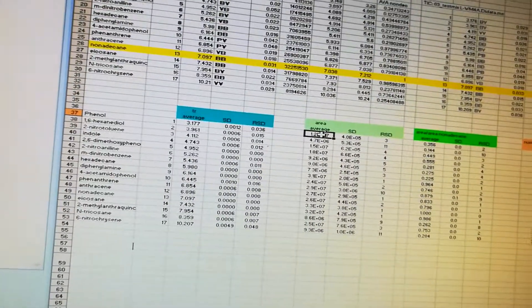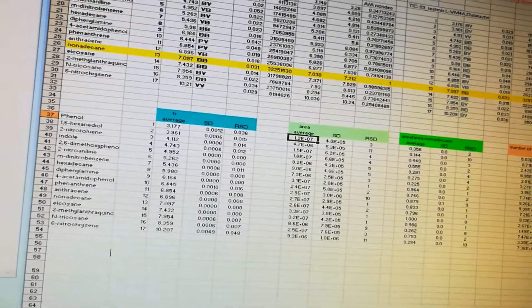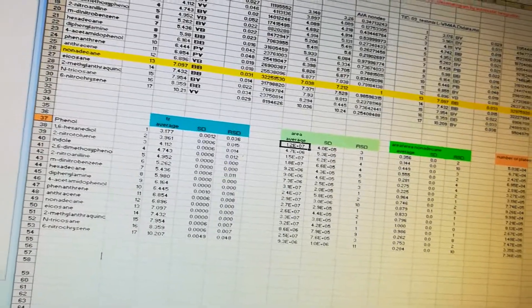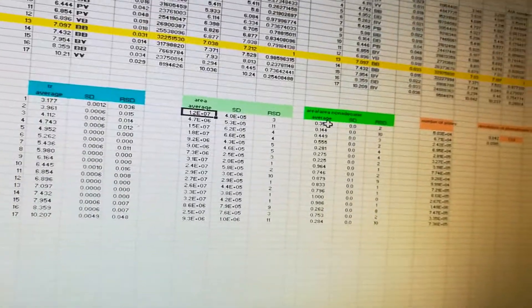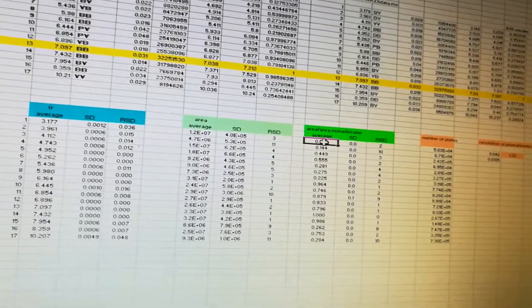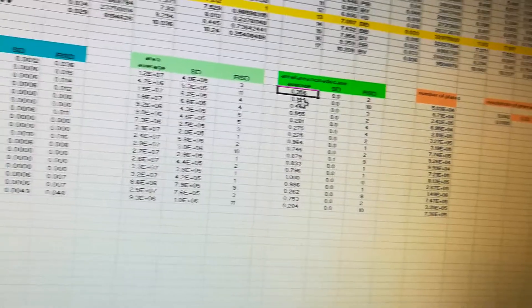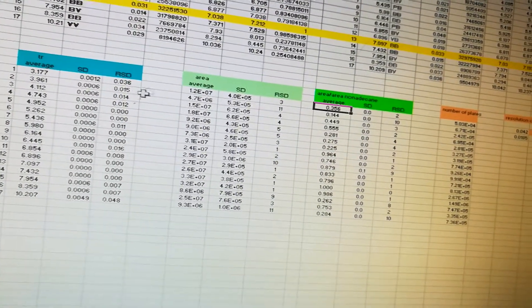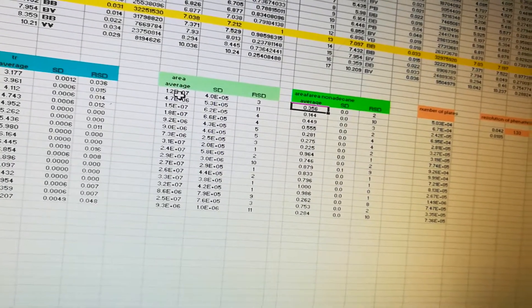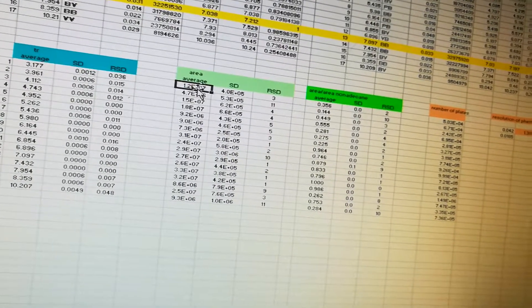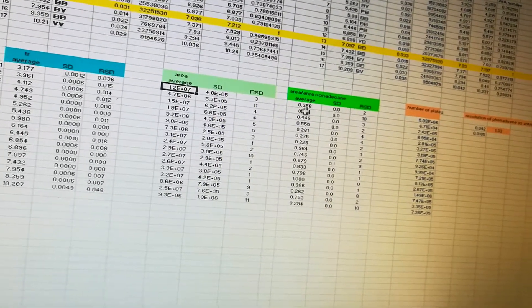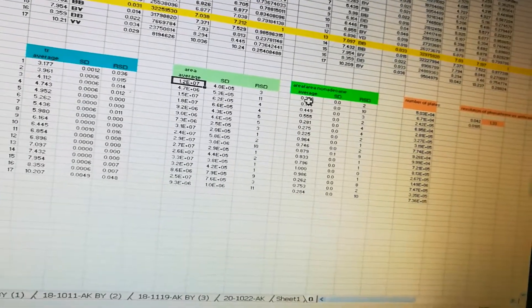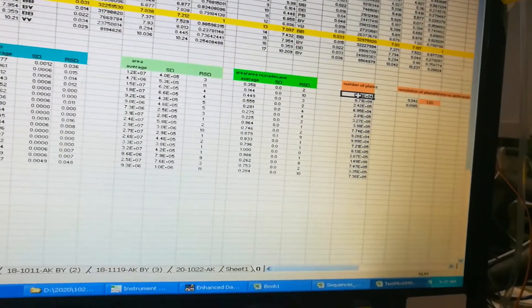Same for the area: take the average area for all three trials for each of the 17 compounds, then figure out the standard deviations and RSDs. For the area ratio column, what I did was take the average area of the compound over the average area of nonadecane — so you get the average area of that compound over the average area of nonadecane for all 17 compounds. Next is the number of plates.